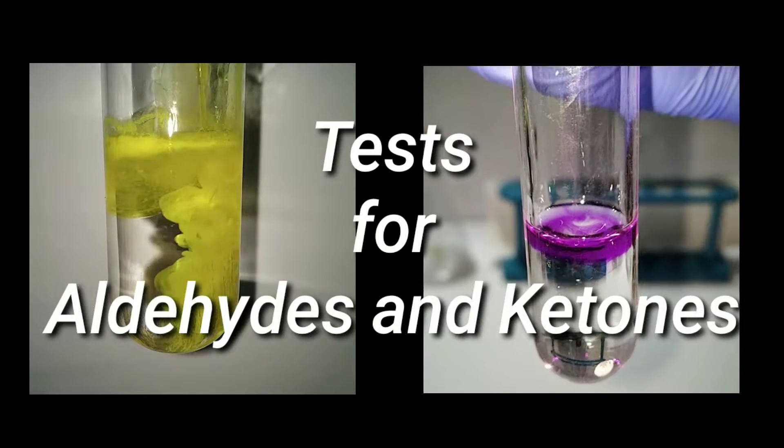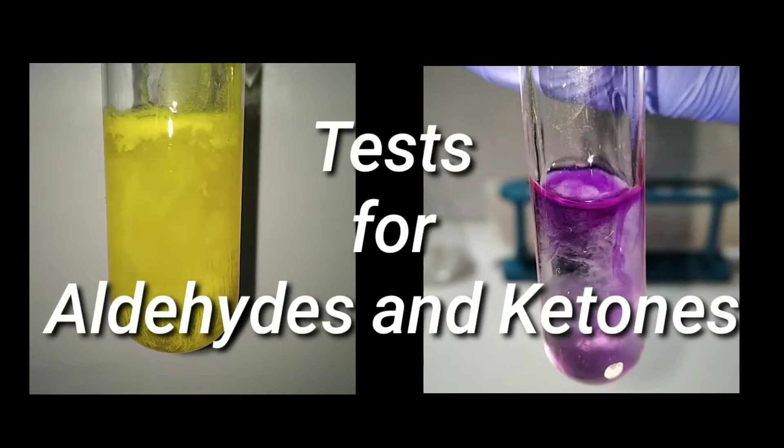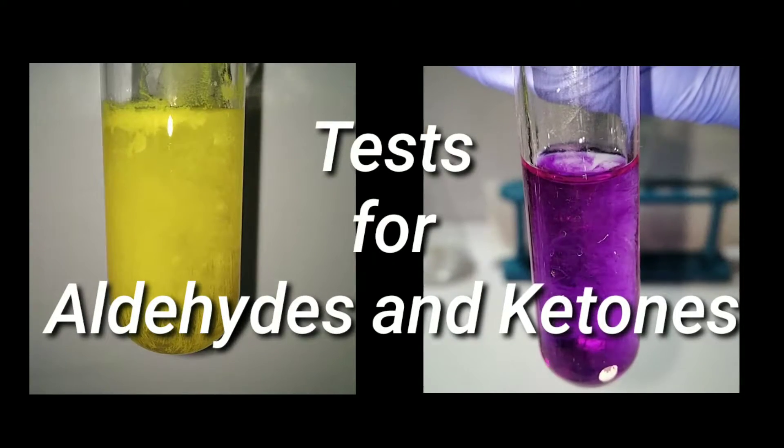Hello friends, in this video we will perform various tests for carbonyl functional group, that is aldehydes and ketones.